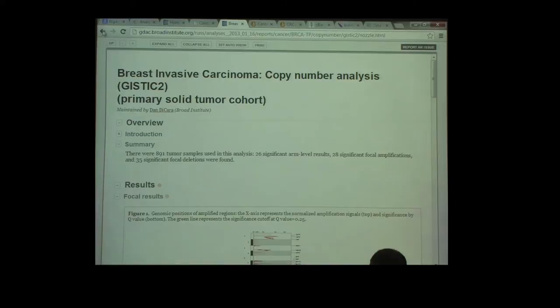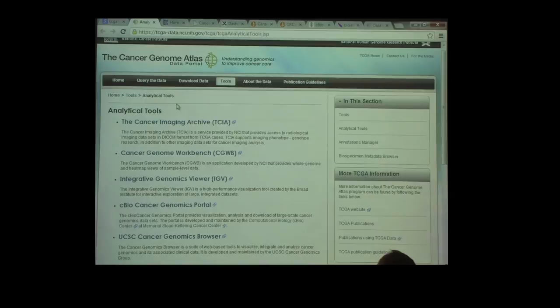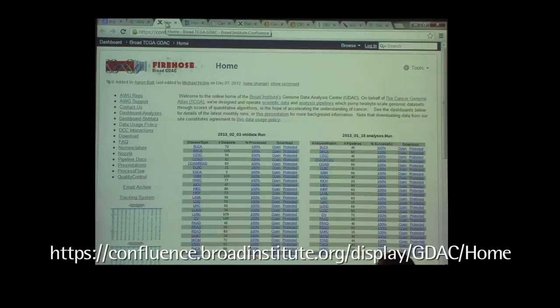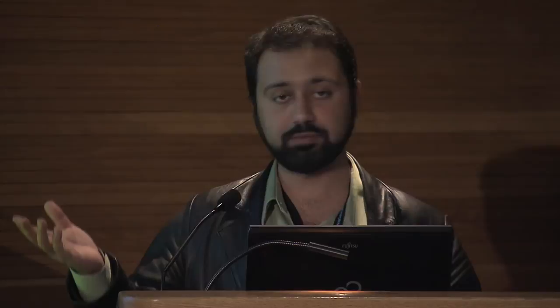Let's go to another tool — Firehose. Going back to the tools page and clicking the Firehose link — Broad GDAC Firehose — you end up at the main page on the Broad website. What is Firehose? Firehose is actually a pipeline that runs many different analysis modules provided to Broad from different institutions. Some are created by Broad themselves, some are provided by different GDACs — we also provided our module to Firehose. Firehose integrates all of these modules and produces reports based on the data. Every month, Firehose takes all available TCGA data, runs these modules, gives you the outputs, and publishes the reports. On the left-hand side you see the data, on the right-hand side the analysis results.